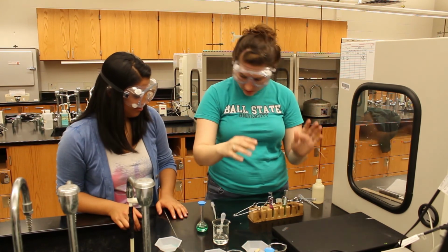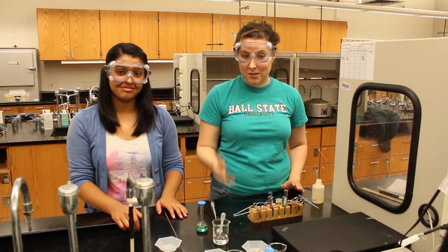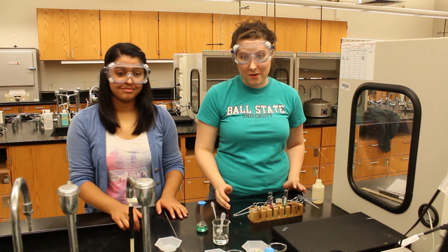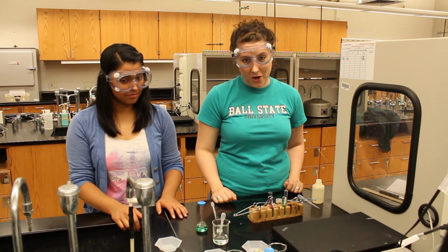Anyway, once you've recorded all your data, be sure to properly dispose of your nickel 2 sulfate solution, and then clean out your volumetric flask thoroughly before you put it back on the cart.